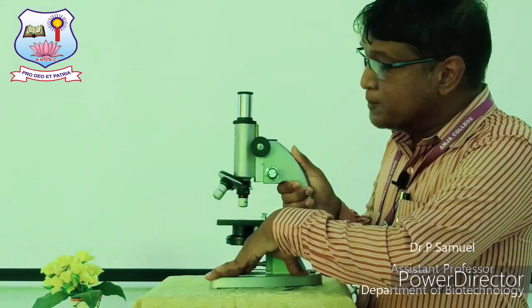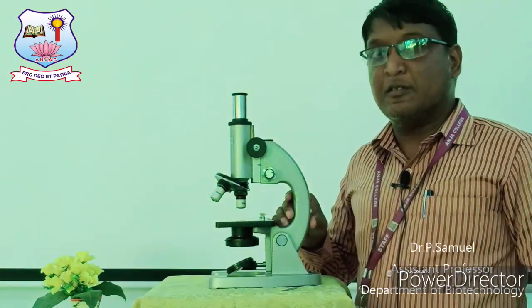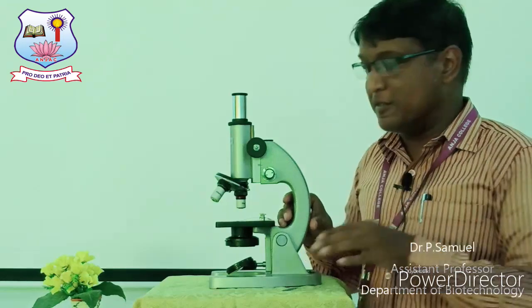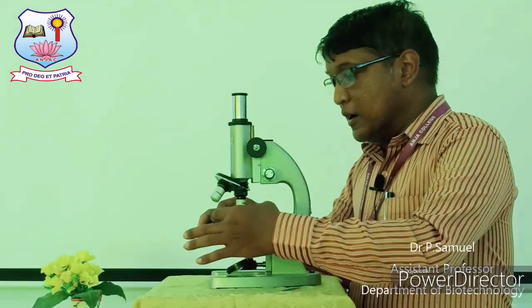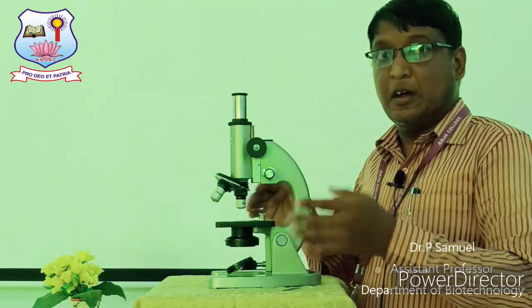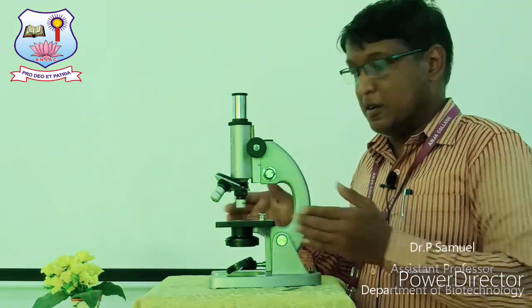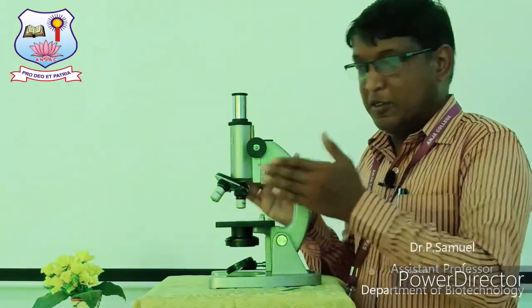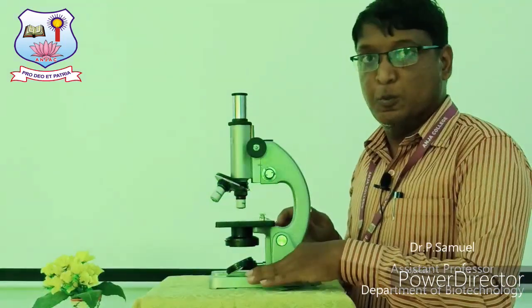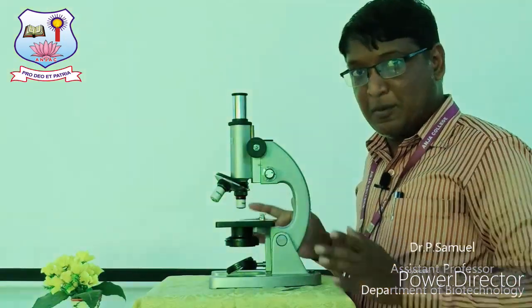With the help of a normal compound microscope, the maximum magnification is 1000 times, which means a sample in the slide can be magnified up to 1000 times from its original image. So this is what a compound microscope can do, and this is a very basic version of the microscope.